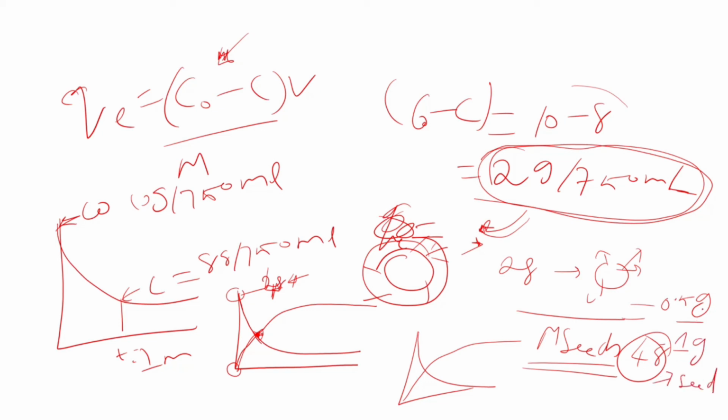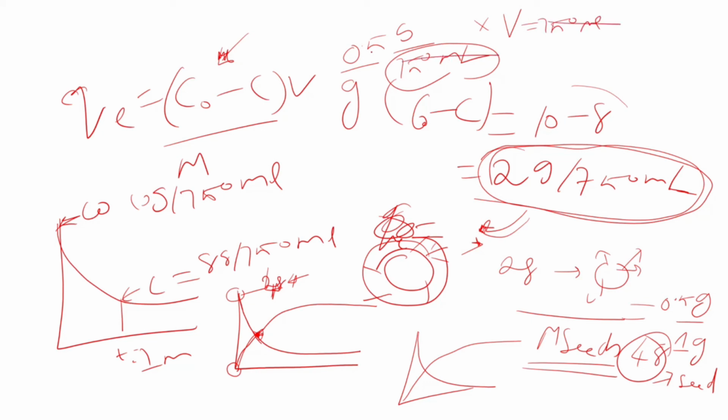But what we are moving is exactly 0.5 grams per 750 ml, divided by something expressed in grams. If you need to remove this volume, just multiply by your reactor volume, 750 ml, so both get cancelled. Eventually you get some number, grams per gram of seeds.